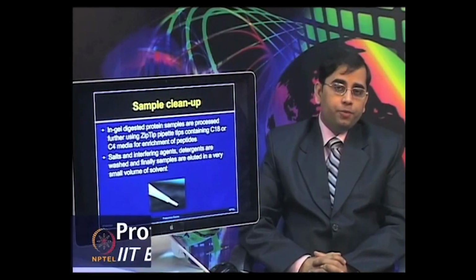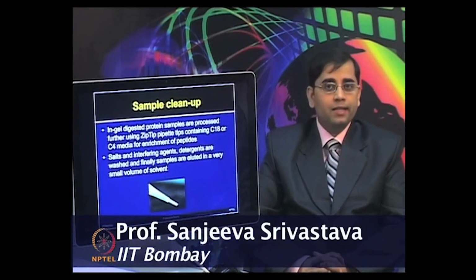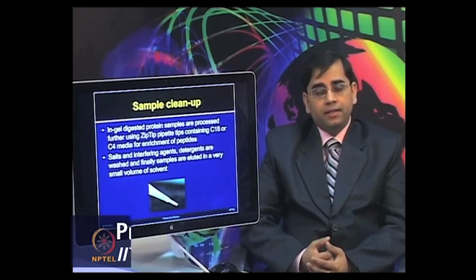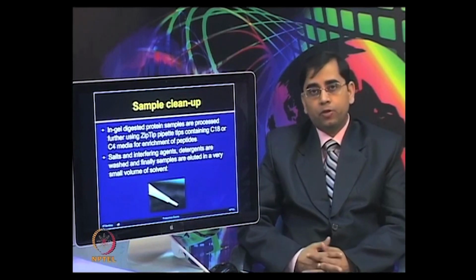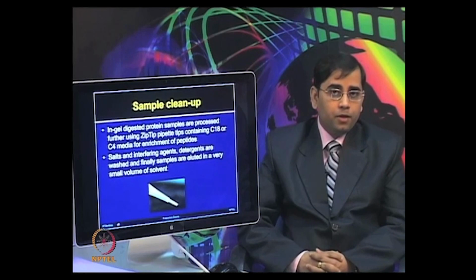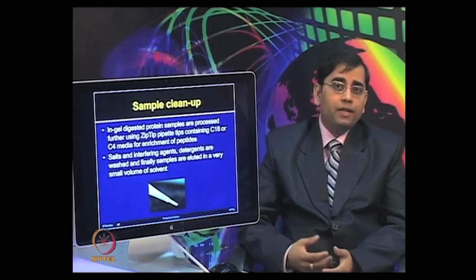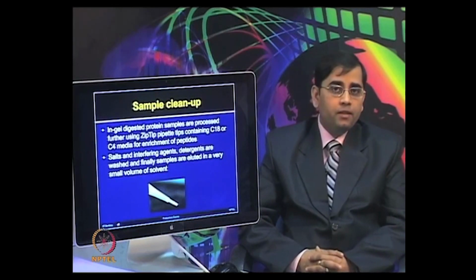So, after watching this video, now you are very clear about the in-gel digestion process and how various steps are important to perform these experiments. Once you have done the in-gel digestion, you can directly use these tryptic digests for further mass spectrometry analysis, but it is often recommended that in between you add one more step, which is sample cleanup. You do not want your columns or your MALDI instrument to get clogged due to the salt or some other interfering residues present in the mixture.